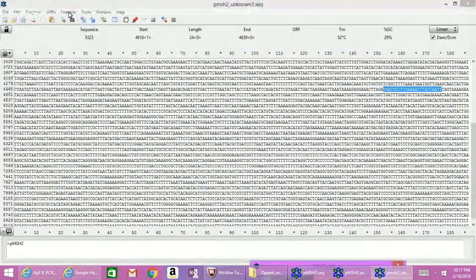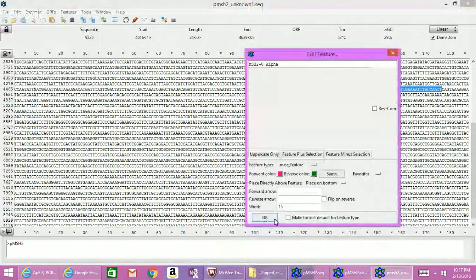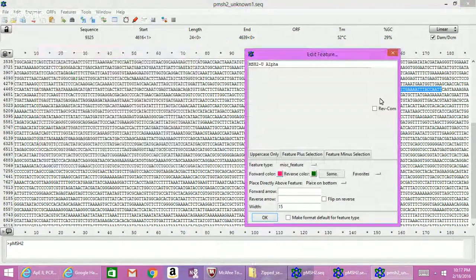I don't know why that's happening. It should let me press OK.